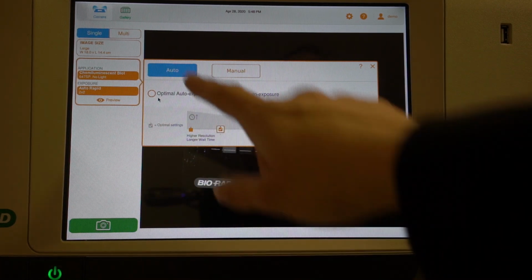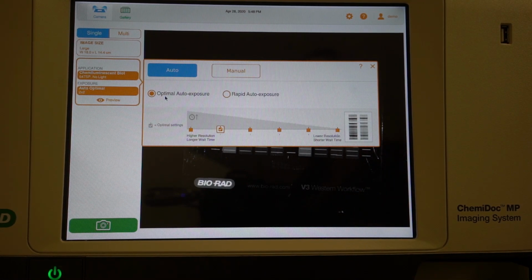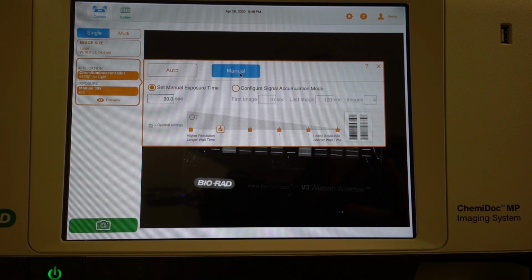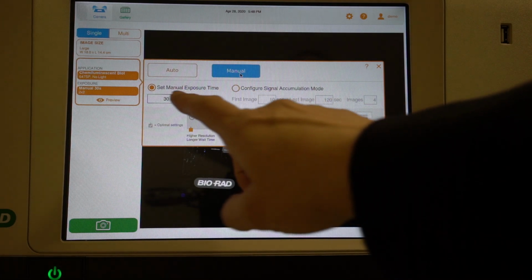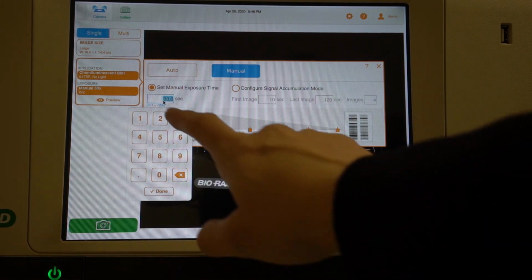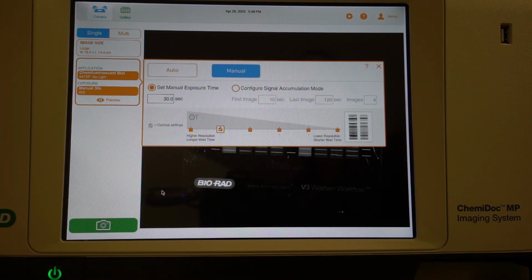The optimal is now saying, I want you to take as much time as you need to get the best picture that you possibly can. So the manual option allows you to go in and set a manual time. So you can choose this box here, type in 30 seconds, hit OK, and it'll do a 30-second exposure time.